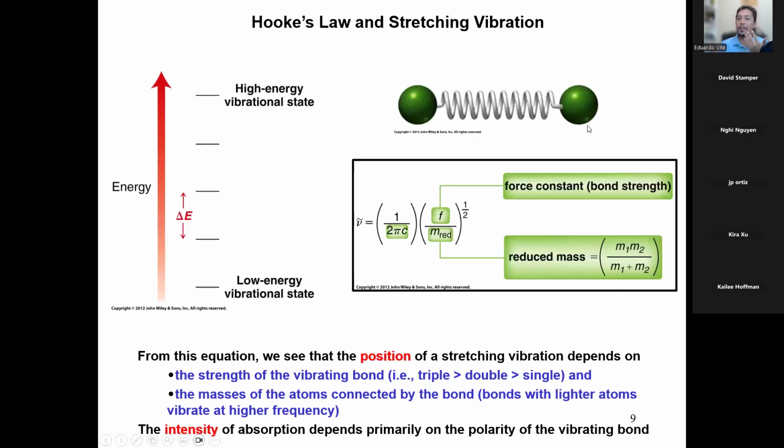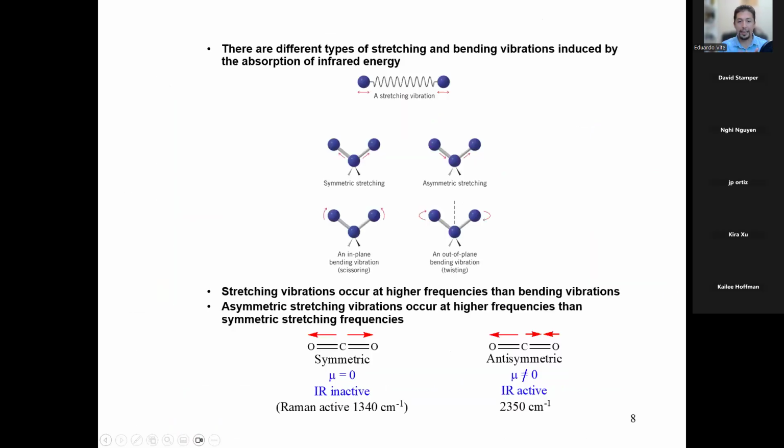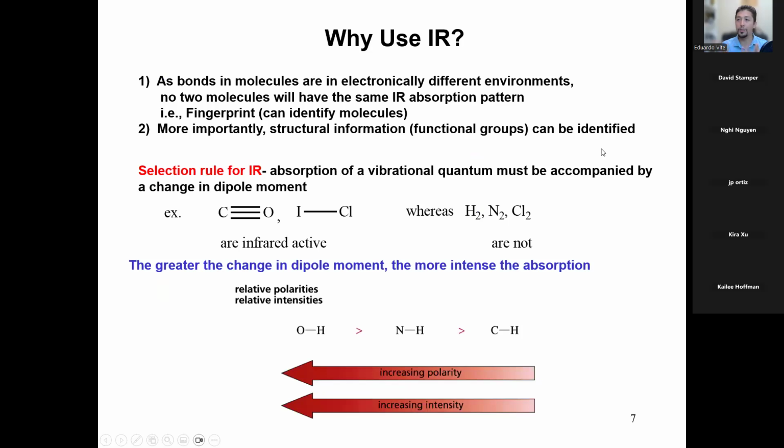But you could think of this like a spring, right? And again, going back to physics, there is a formula where you can actually go and substitute the molar masses of the atoms and find out what frequency they will vibrate at. If you have carbon and carbon, well, that's one vibration. But as soon as you replace it with something a little heavier, that's another vibration. Carbon nitrogen, carbon oxygen, carbon fluorine, carbon hydrogen, they are all different frequencies. They have their own unique vibration, their own unique fingerprint vibration. And so using that principle, we actually have a unique signature for pretty much all functional groups.